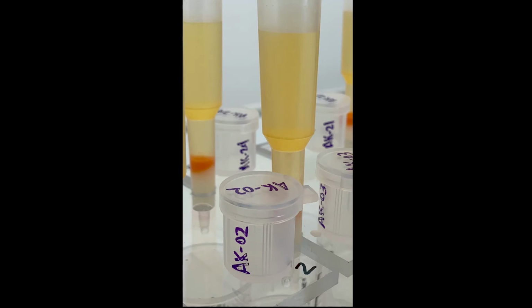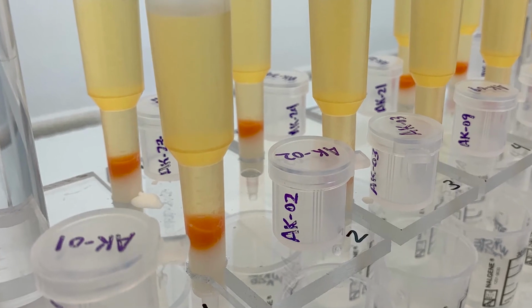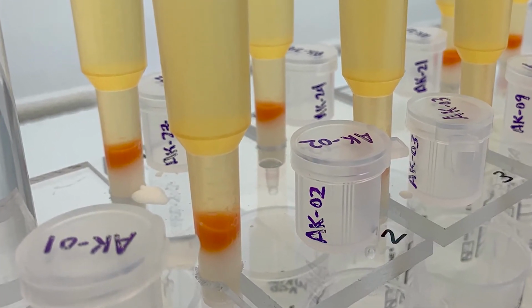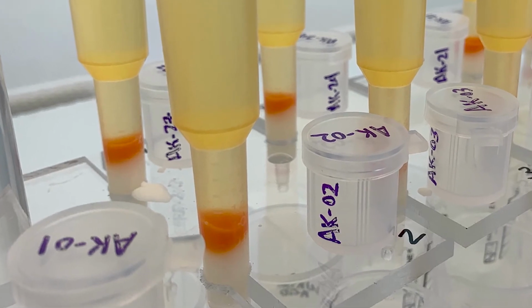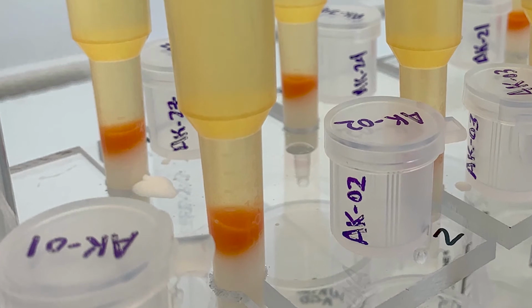Once our samples have been dissolved and they're a pure liquid, then we run them through columns for purification. You can see the columns here. So at the base of these columns is a resin, which essentially is just little tiny beads that have different affinities for all the different elements on the periodic table. What this means is as a solution drips through that resin, all the elements that were in that rock connect and bond with this resin. It's like they're hugging it almost.